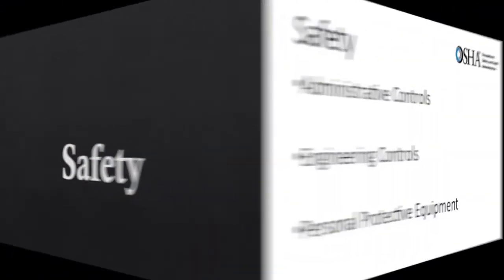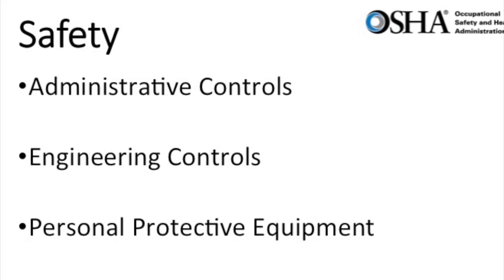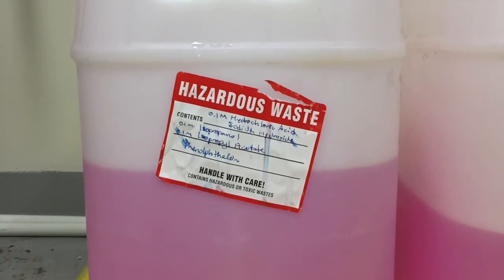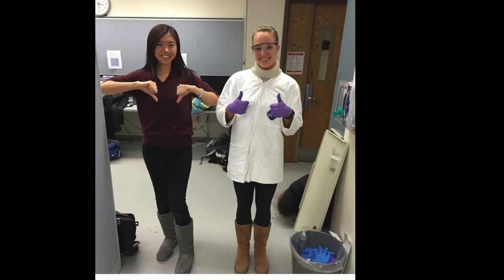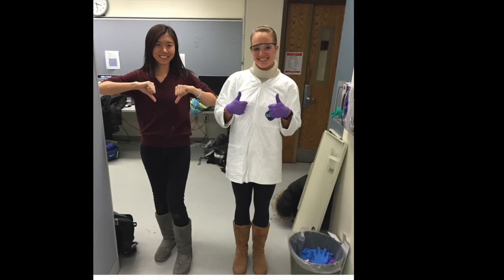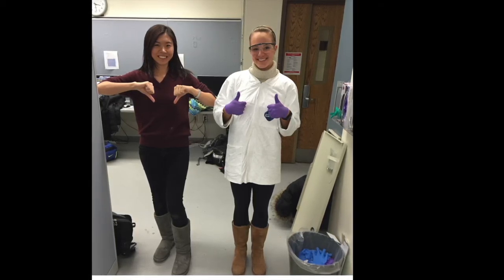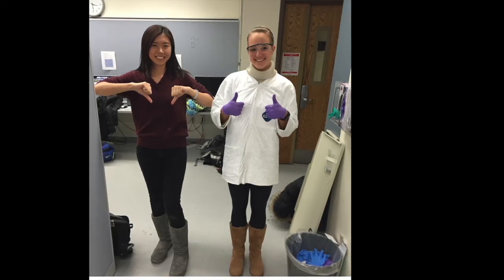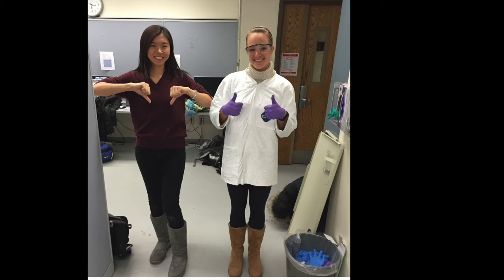Safety. There are 3 controls: administrative control, engineering control, and personal protective equipment. To prevent contact and ensure safety, all technicians handling the reagents or taking samples from the reactors should wear gloves, eye goggles, and a lab coat at all times. Isopropyl acetate is also flammable, hence should be kept away from any source of heat.